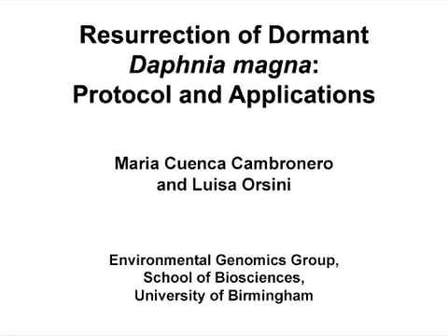The goal of this experiment is to resurrect dormant stages of Daphnia magna species. This is a powerful method that dramatically advances data collection to generate long-term data in natural systems. This method enables the study of ecoevolutionary processes which occur over extended periods of time in nature within the time frame of a research project.